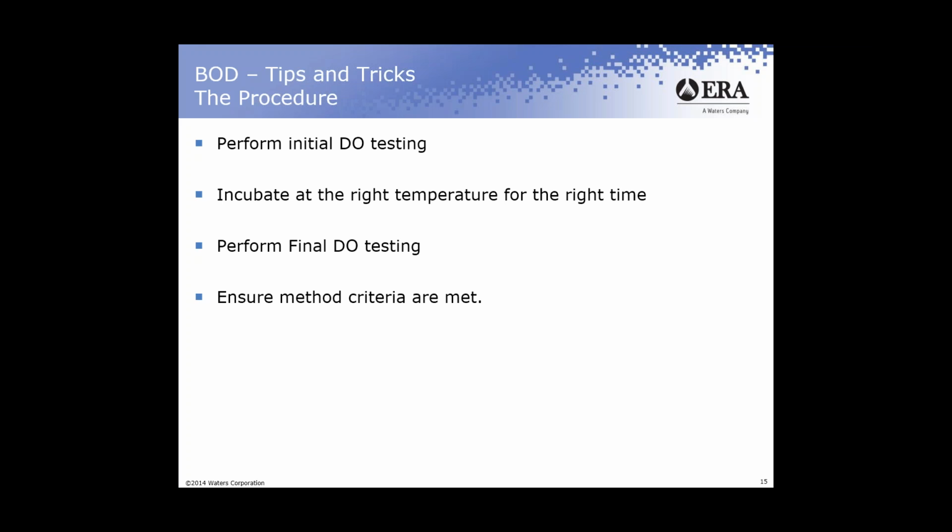Make sure that your DO probe, if you're doing it by either membrane electrode or the new RDO or the new LDO, is properly maintained. Make sure that you do the maintenance on it. Make sure it's calibrated properly.